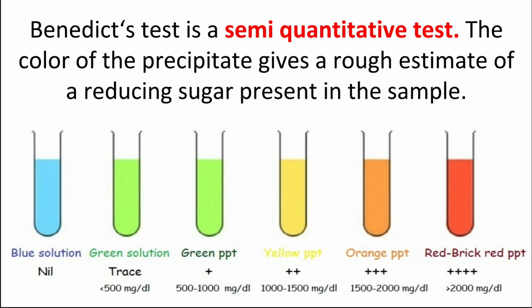Now let's see how the practical is actually performed. We'll see the negative Benedict test first and then the positive Benedict test.